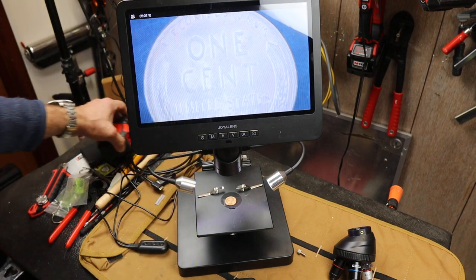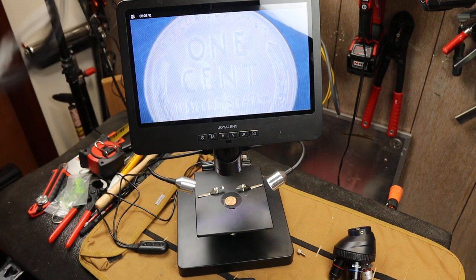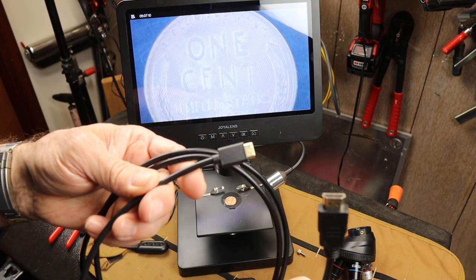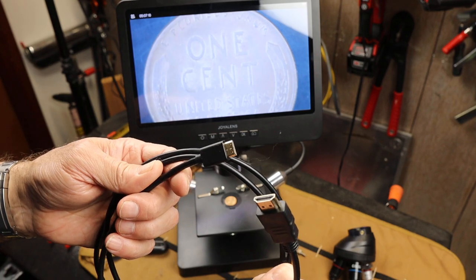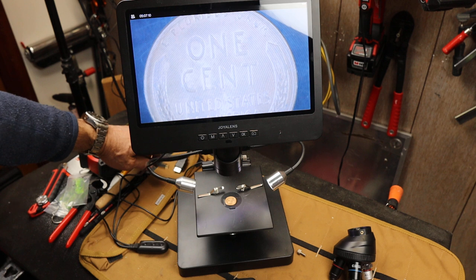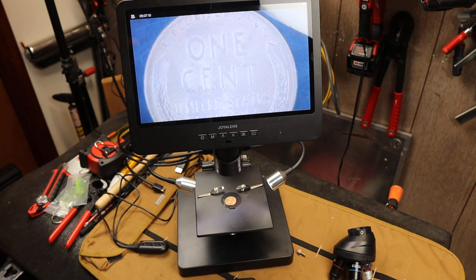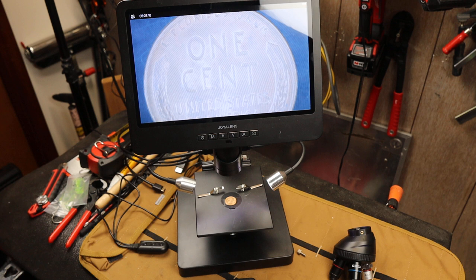So it's a pretty good screen, and of course it does have HDMI out, should you want to plug it into a larger monitor. Razor sharp, in fact this will shoot video resolution, I can get Ultra HD at 2880 by 2160 at 24 frames a second.